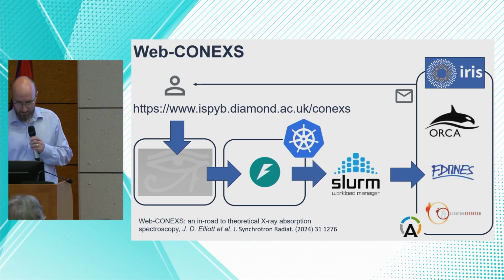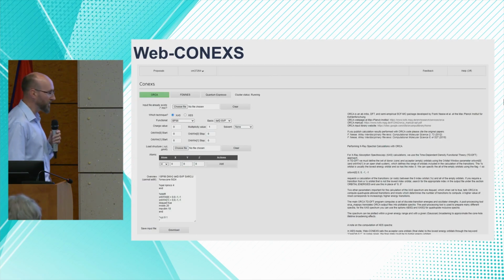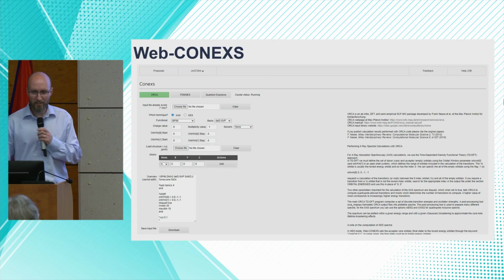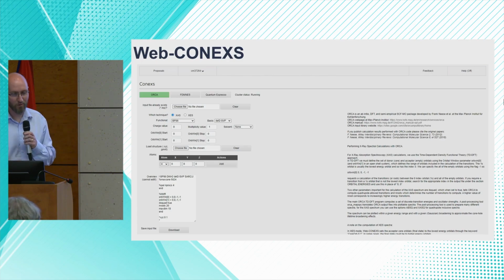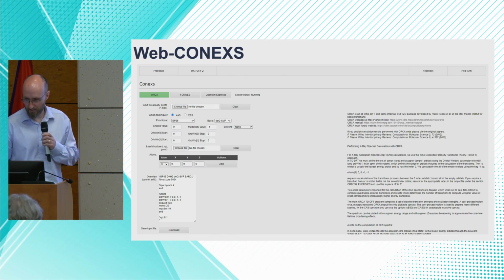It's a really brilliant system, and this kind of allowed us to make quite a cheap MVP that gave them a simulation as a service portal. So if you're familiar with SynchWeb, you'll recognize the SynchWeb gray, but this is the relatively simple view form that they have that lets them input a structure and define some very basic parameters and run the simulation.